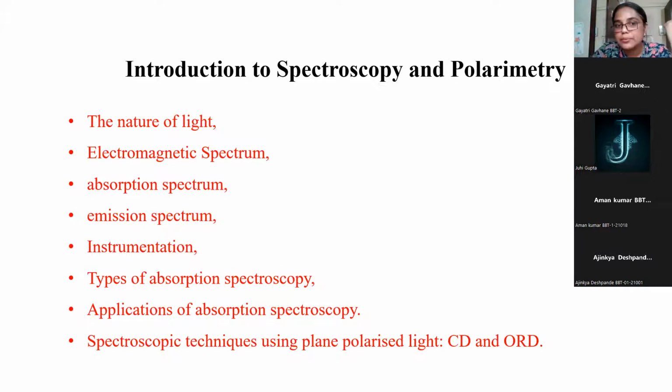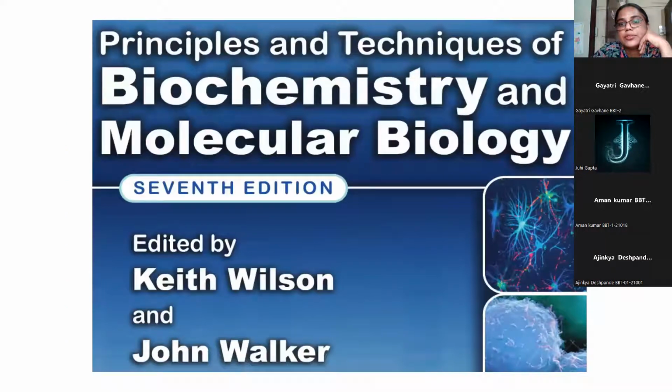Excuse me, ma'am. Can I answer? Yes, please. Ma'am, these instruments mainly increase the accuracy, or these are less time consumable and more accurate with the observations. Yes, so these instruments actually speed up the analysis. It's a technique that will speed up something. What will it speed up?